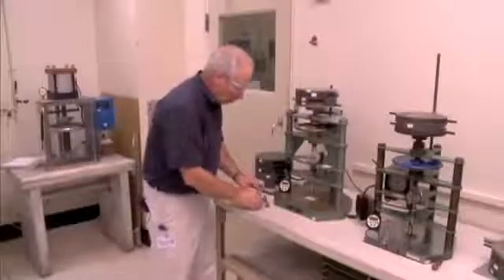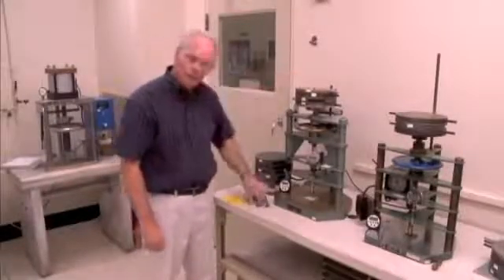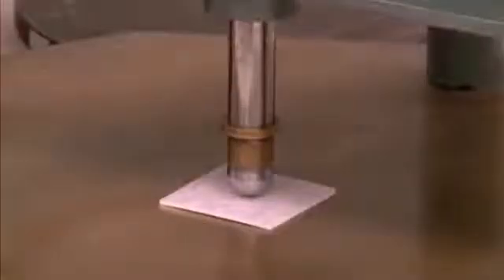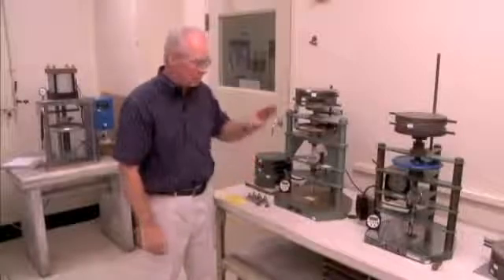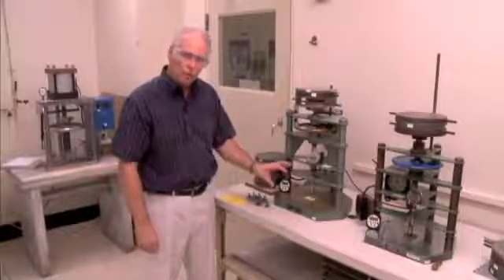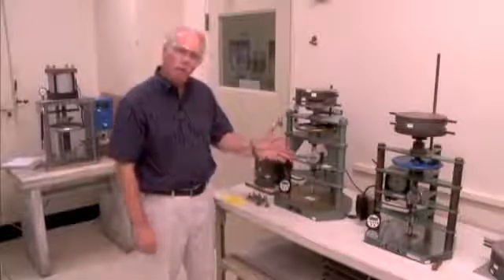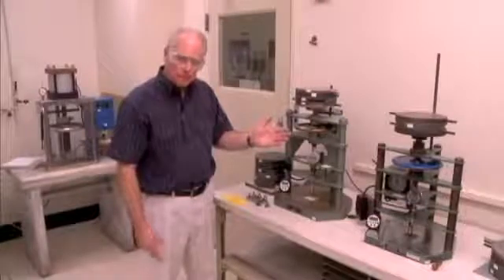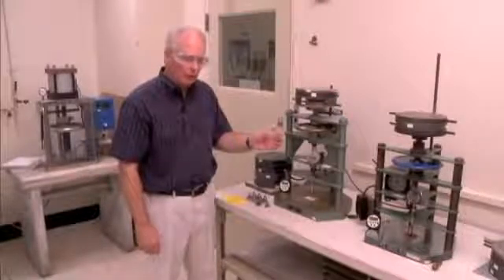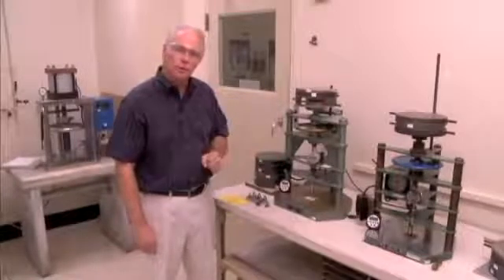The test method will also specify the load that will be applied to that indenter foot when it's installed in the machine. And it'll also tell you what the dwell time is. And the dwell time is the amount of time that the load will actually be applied to the floor. Then there's also, for some tests, what we call a recovery period. After the load's removed, typically that's about 60 minutes, the recovery period, the sample's allowed to recover, after which they'll go measure for residual indentation.